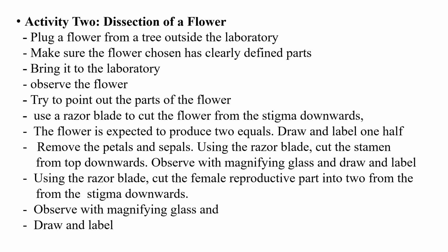Then for the third diagram, you are going to use your razor blade to cut the female reproductive parts. You cut it longitudinally into two, that is the stigma. Observe what you see with the magnifying glass, then you draw and label what you observe fully.